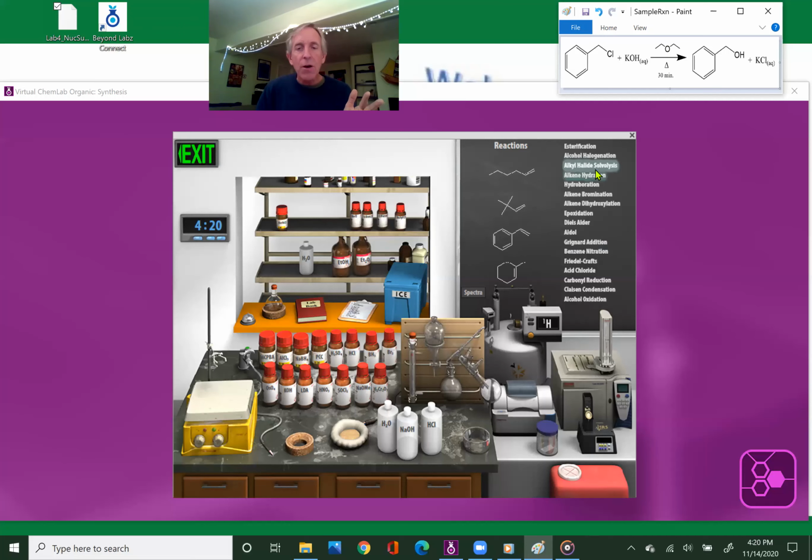For you, we're going to go up here and play in the alkyl halide solvolysis section, and notice here are all the reactants listed right here. Here are all the reactants that you have accessible for this reaction that we can design. Our three experiments in lab are going to use the t-butyl chloride, otherwise known as 2-chloro-2-methylpropane. It's going to use the 1-chlorobutane down there a little bit.